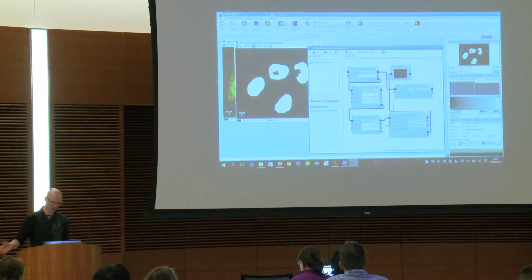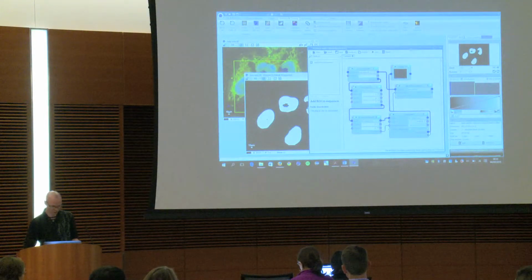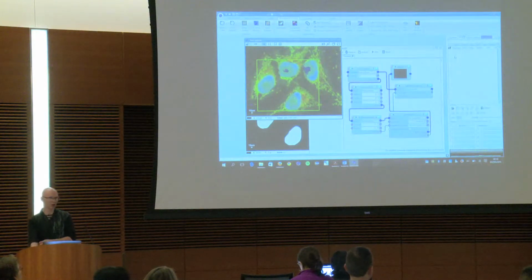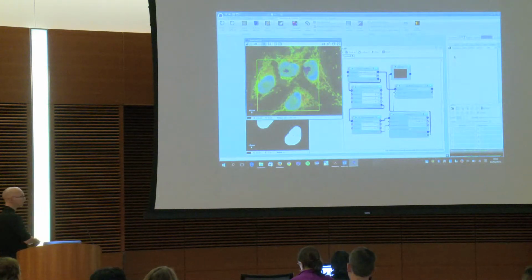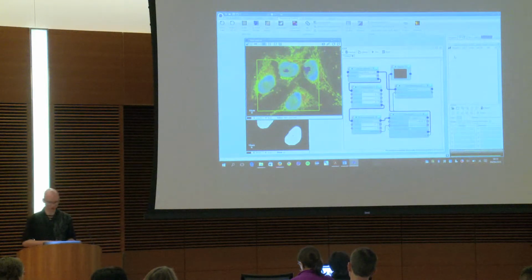Overwrite means that we will remove the previous ROI from the image. So we can check it. If we run several times the protocol, we won't have many ROI appearing. So if I click on run, I receive my ROI over my original image. The problem of this ROI is that it doesn't separate the different objects. I have a ROI, but a complete mask as a binary image. So it's not very interesting still.